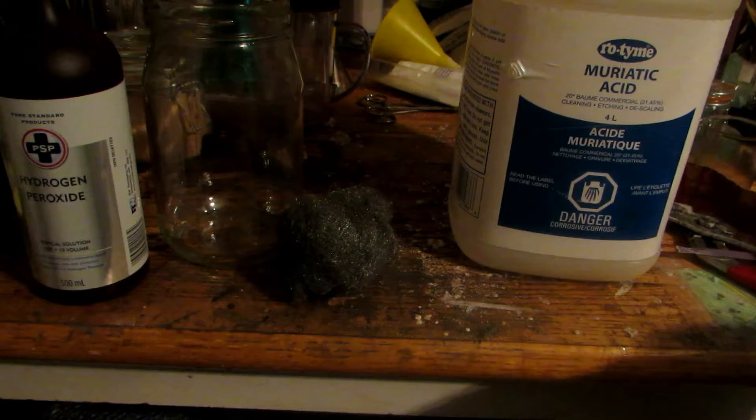Hey guys, and welcome back to another video. Today we are going to be making Iron 3 Chloride. This is very useful in an experiment known as the Chemical Garden. When you drop transition metal salts into a solution of sodium silicate, the insoluble metal silicates precipitate out, and it looks like a garden — very, very cool. One of the transition metal salts I'm going to be using is Iron 3 Chloride.